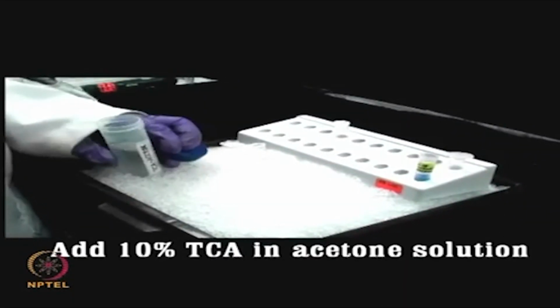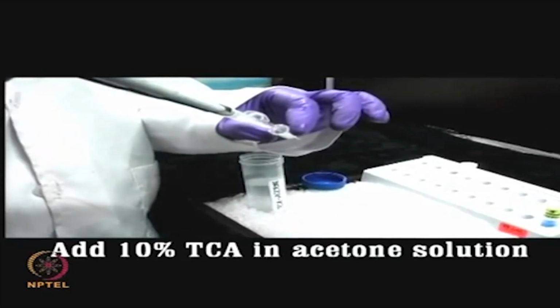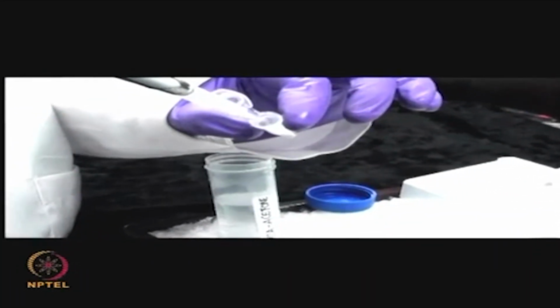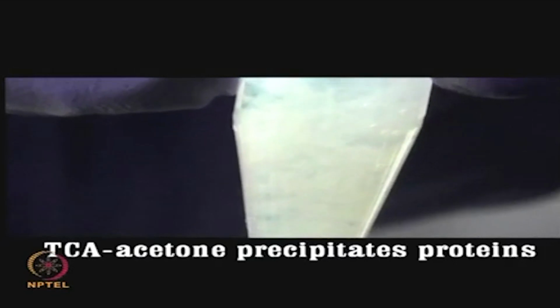To this, add a mixture of trichloroacetic acid and acetone and mix the contents well. The solution gradually becomes turbid due to precipitation of proteins.